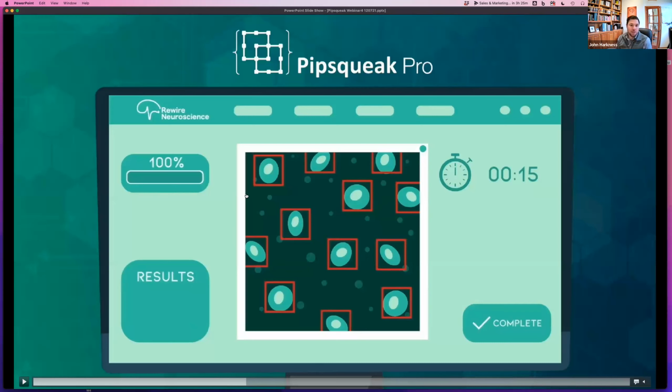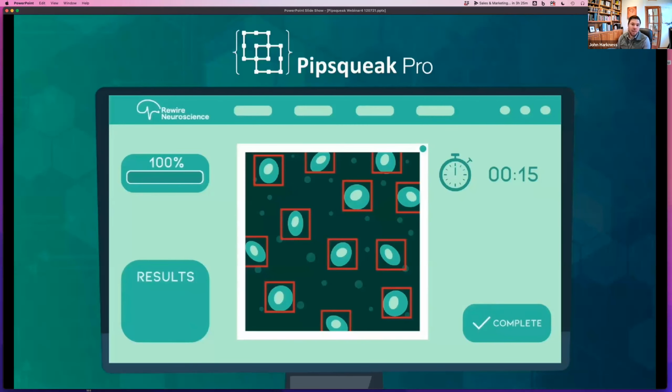My experiments always started with behavior. I'd be running some behavioral experiment with rats or mice. We would prepare tissue samples on slides, staining with immunohistochemistry or immunofluorescence. And then I would go image them on our confocal microscope. That meant I was always bringing terabytes of images back to my laptop and sitting there on ImageJ trying to count these cells, detect these cells.